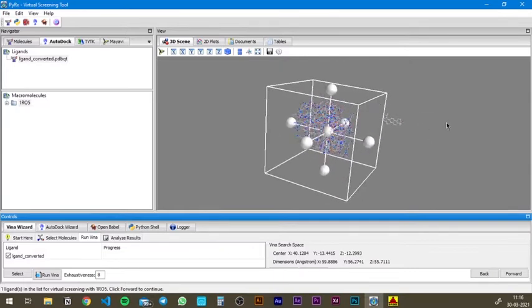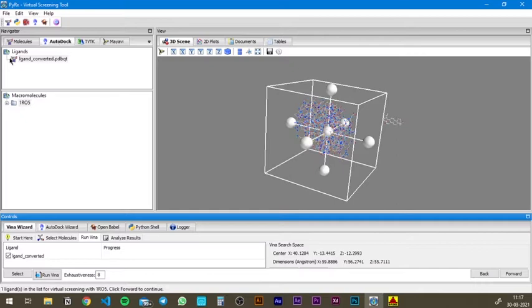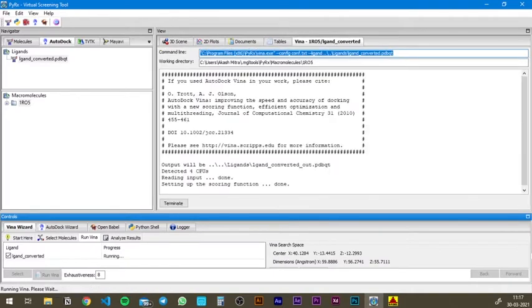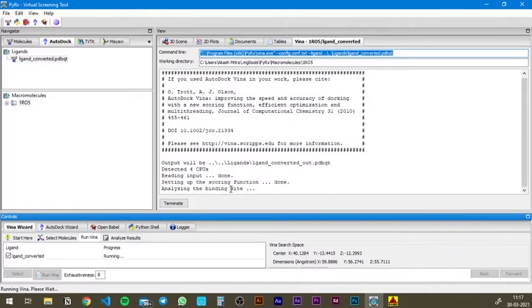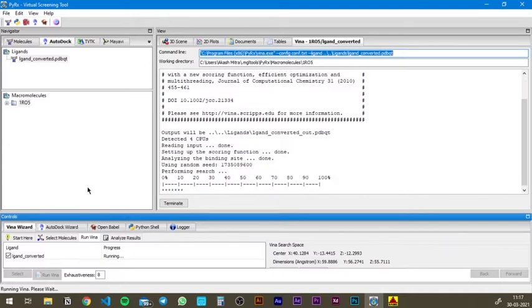After the whole protein is inside the box, hit forward. Pyrex uses something called AutoDock Vina — AutoDock Vina can be run independently, but Pyrex has it integrated inside it, which is why you can see it written AutoDock with the ligands and macromolecules inside. It is going to work through some Python code, analyze the binding site, and finally give us the result once it is 100% complete.